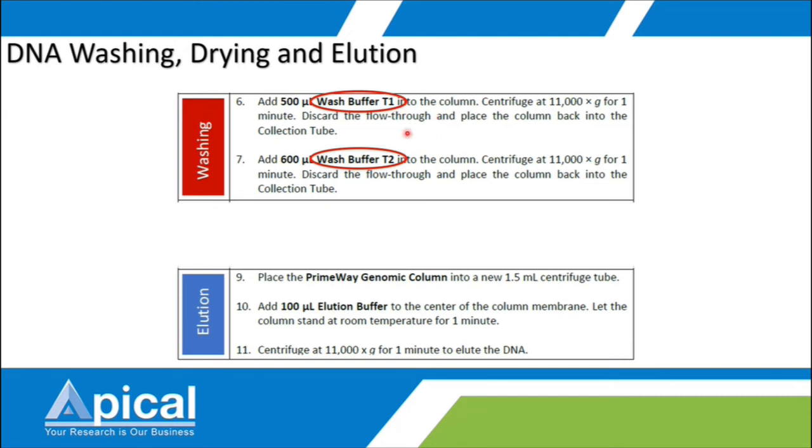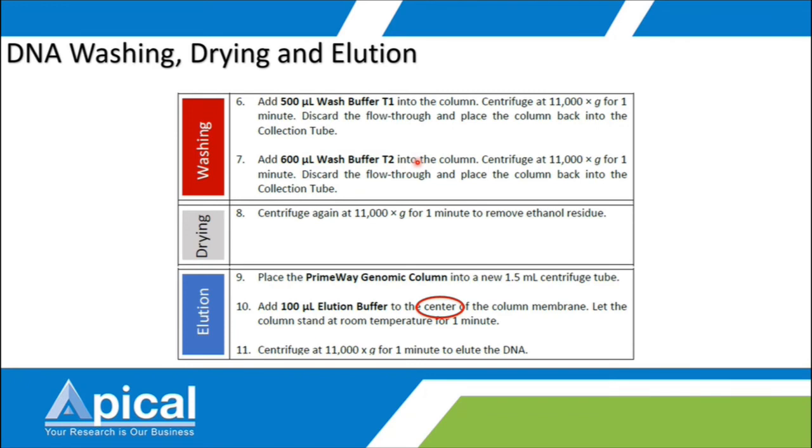And the second wash buffer, which carries ethanol, helps to eliminate salt. So with these two washing steps, you clean away all the protein and salt, and make sure your extracted DNA is high in purity. Okay. The drying step is very important.